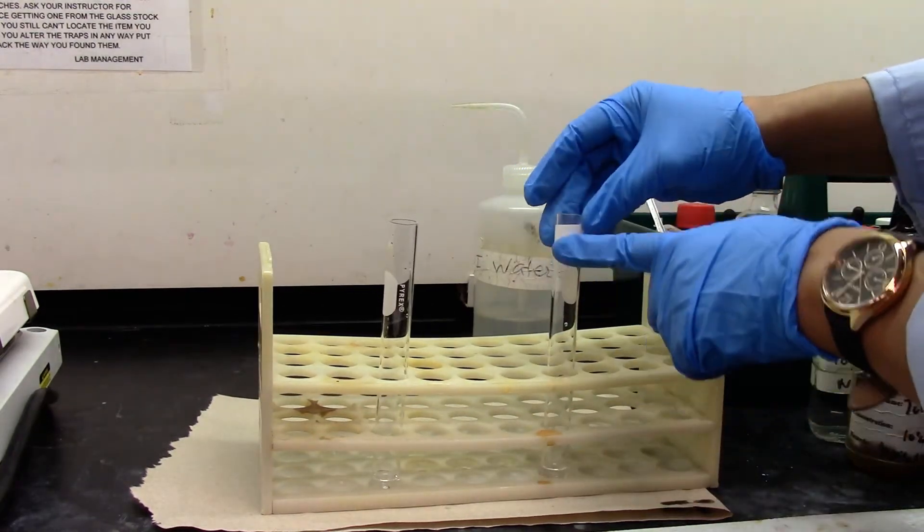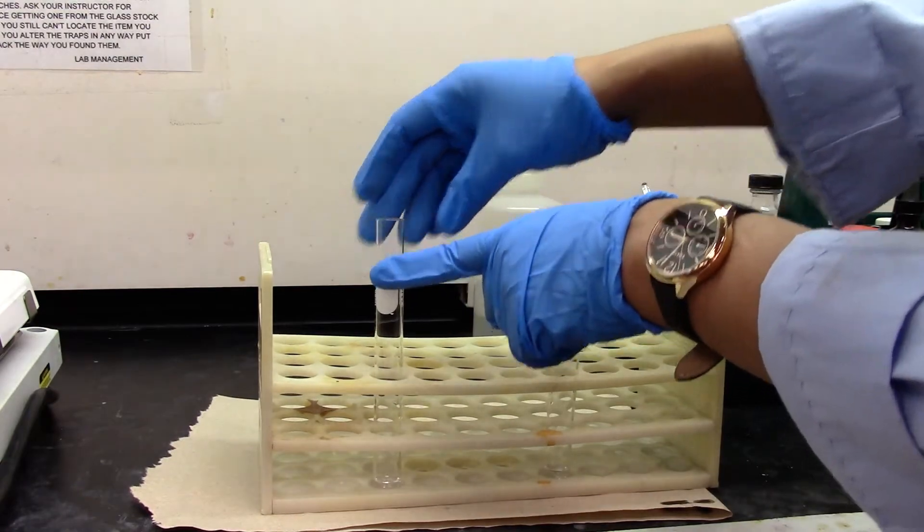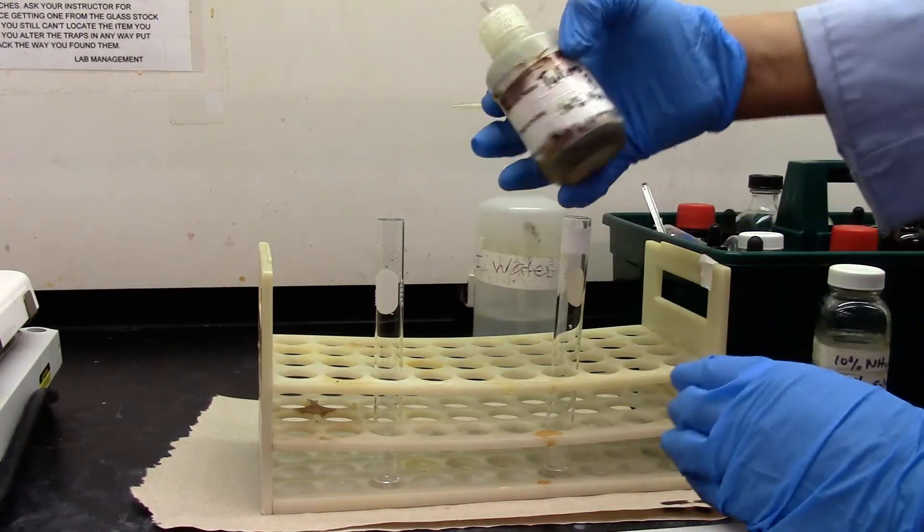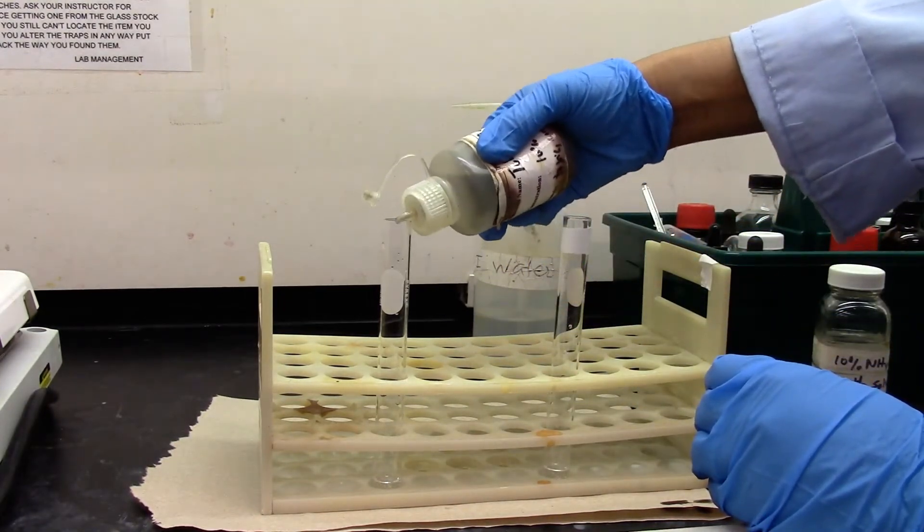This is our negative test. This will be our positive test. Next I am adding Tollen's reagent B, which is 10% sodium hydroxide.